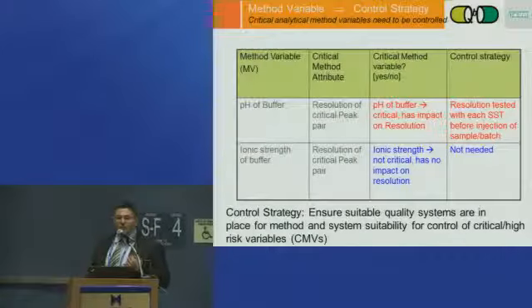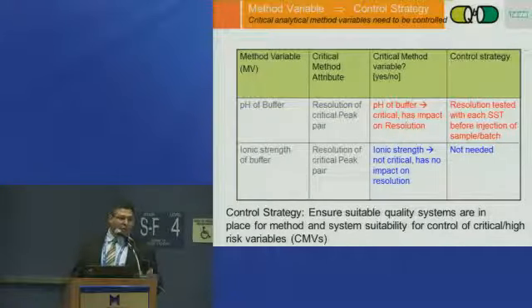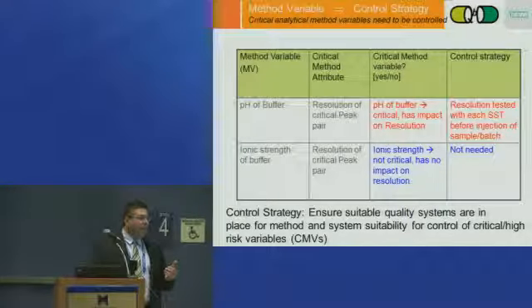Now, sometimes you may not have that particular impurity, or it's only available in small quantities. But for example, let's say it's an oxide, and you know you can easily form an N oxide. So what you can do as part of your system suitability, generate a stress sample in situ, right, and run that as part of your system suitability solution. Because one of the worst things to do is when you transfer a method to QC or to a CRO, CMO, they're going to ask you for that small amount of that impurity. And if your API organization doesn't have that impurity, it just adds additional labor. But if you think creatively and make the sample in situ by adding peroxide, then you can avoid that.